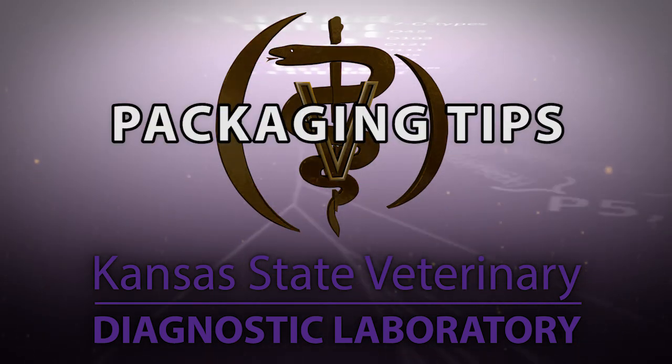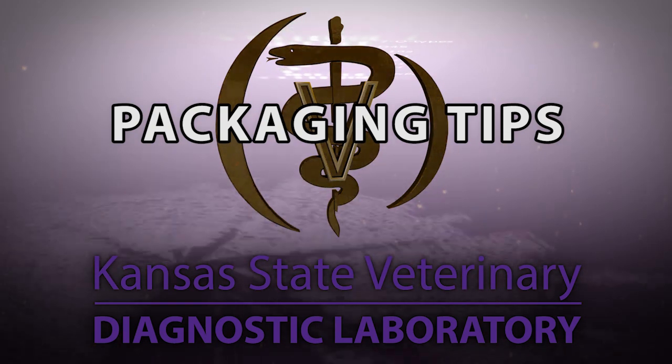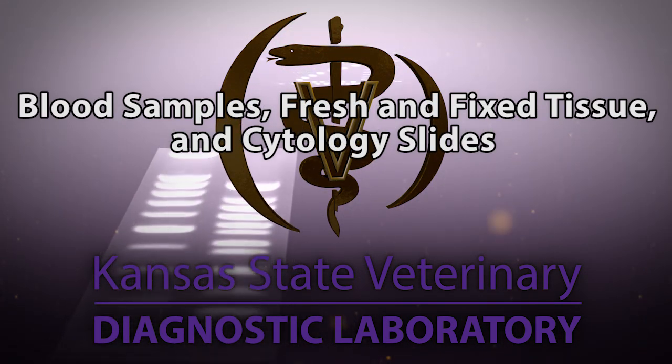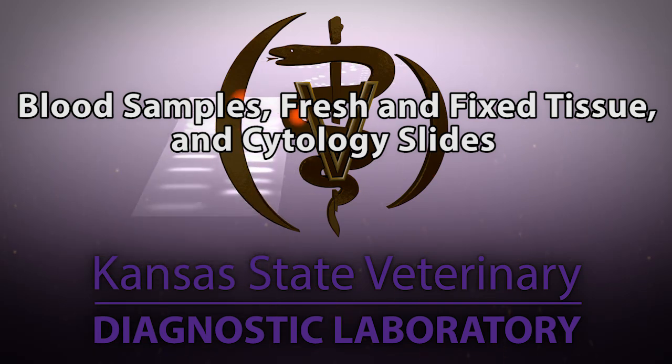All samples for diagnostic testing should be packed using 3 layers of packaging material. This video discusses more specific recommendations for particular sample types.